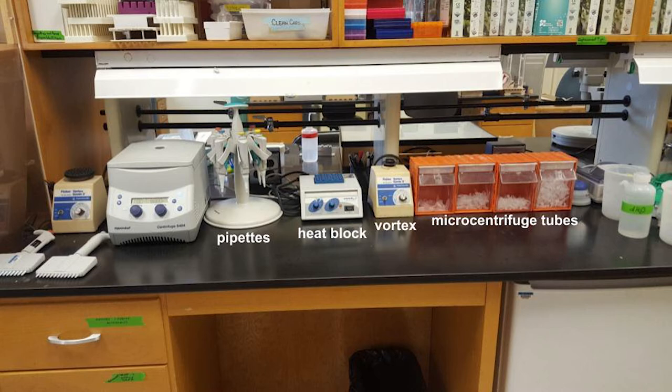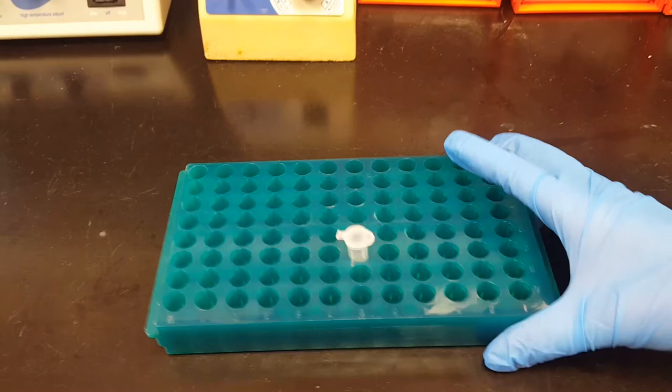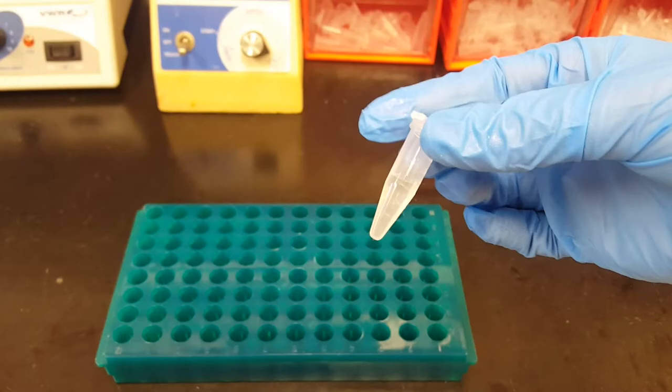And finally we have a centrifuge, which is a machine that we can use to spin our samples really fast. Now let's watch a demonstration of this equipment in action. When working at a lab bench it's really important that we wear gloves to prevent contamination of our samples. Here's a closer look at one of the micro centrifuge tubes — when we are working with samples in these tubes we use a tube rack to help hold and organize them.